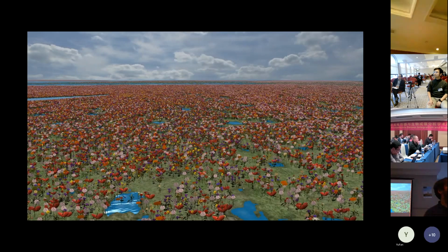Well, we have everything loaded, so everything is in memory. Not everything is in GPU memory, but everything is in CPU RAM. When we zoom out and request different areas, we check the quadtree and ask what's visible now. It identifies the buffer ranges, because we have a big buffer where everything's loaded. That's for the microscope image, and it uses the sparse virtual texture.